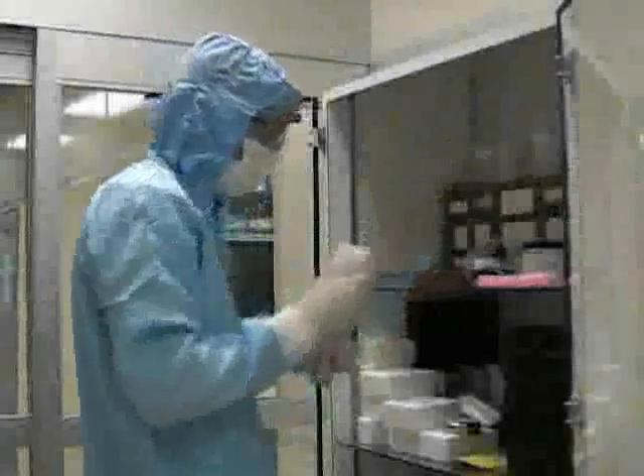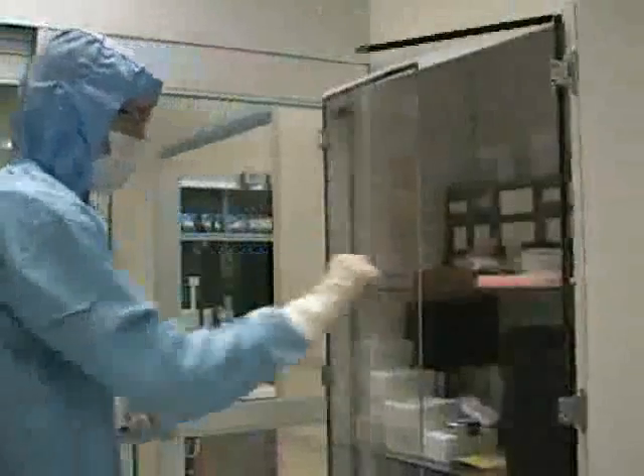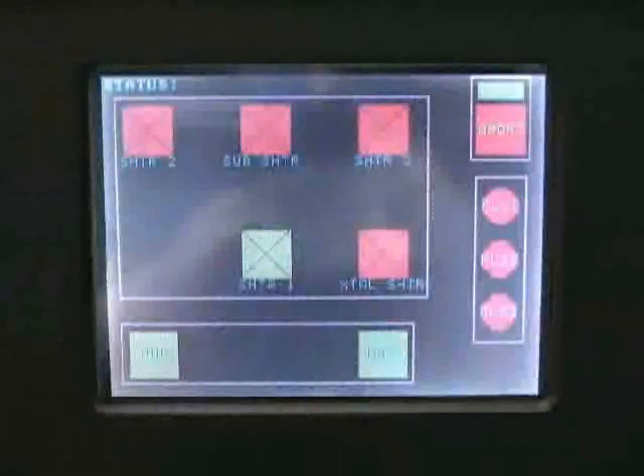You should now be prepared to load the system. To begin loading the system, you must first open the shutter by entering the depth menu on the front panel touchscreen and then pressing the shutter 1 button. You will know that the shutter is open when the button is green, and closed when the button is red.